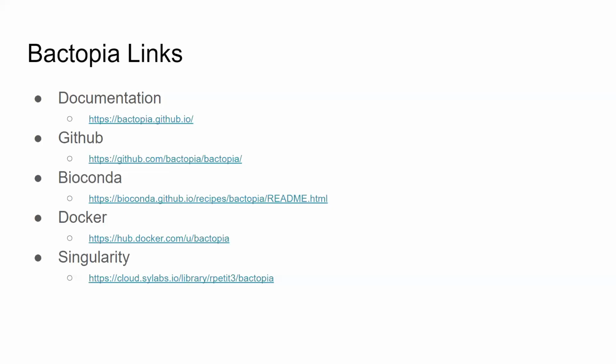But I use per read average quality, read length. This time I did number of contigs, just because it's nice to quickly see this assembly has 1,000 contigs, and there's something going on there when the rest just have less than 100. And what's the fourth one?